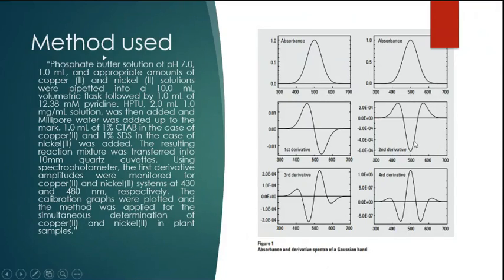Derivative spectra are always more complex than zero-order spectra. A first-order derivative is the rate of change of absorbance with respect to wavelength. A first-order derivative starts and finishes at zero. It also passes through zero at the same wavelength as the maximum absorption wavelength of the absorbance band.